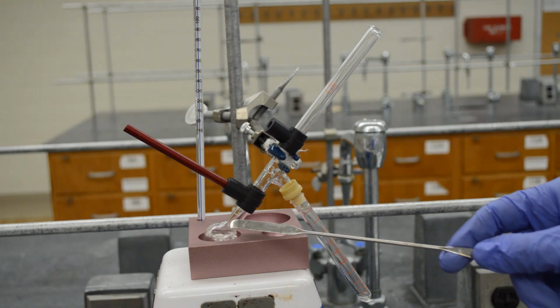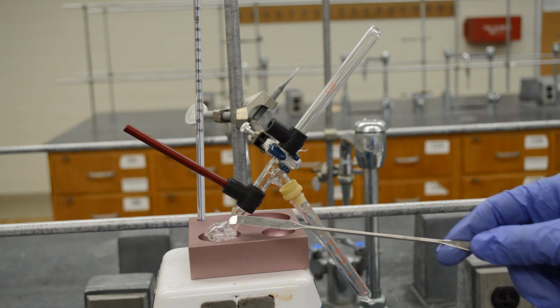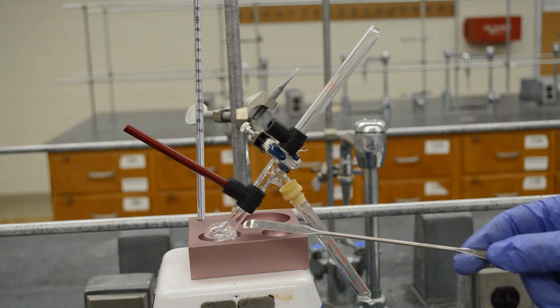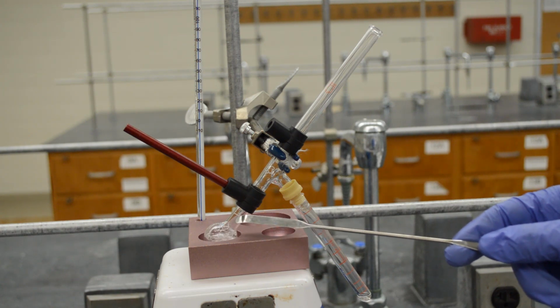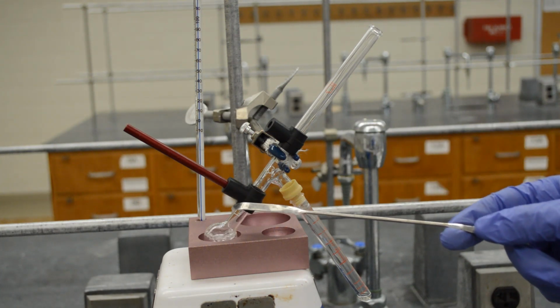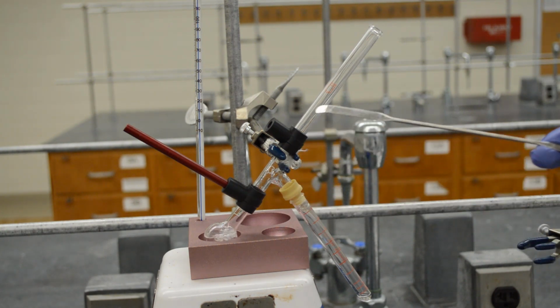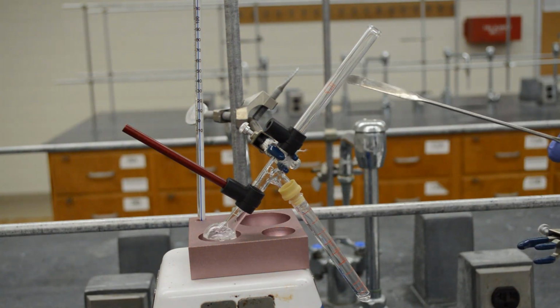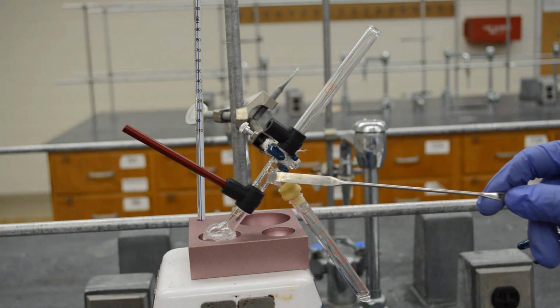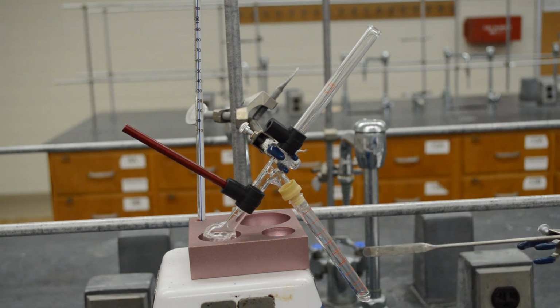What happens here is your alcohol and carboxylic acid react in a Fischer esterification, and the products are ester and water. Water is the byproduct, and at this temperature they both evaporate. Both the organic and aqueous components will evaporate, and they condense in the air condenser and drip back through the side arm into the test tube. So you have both the ester and water, the organic and aqueous phase, in the test tube.